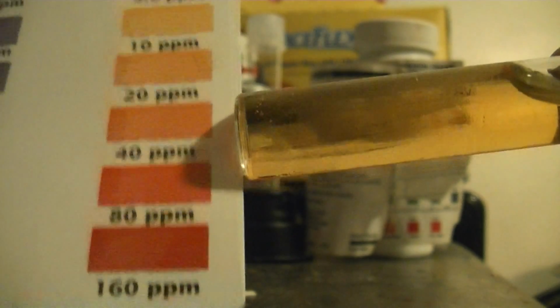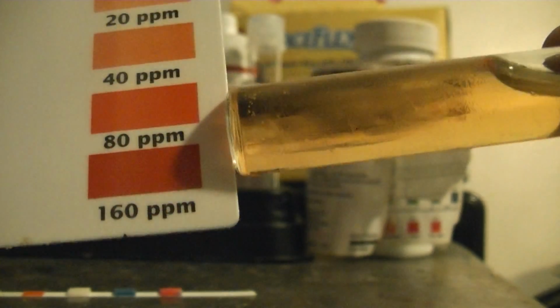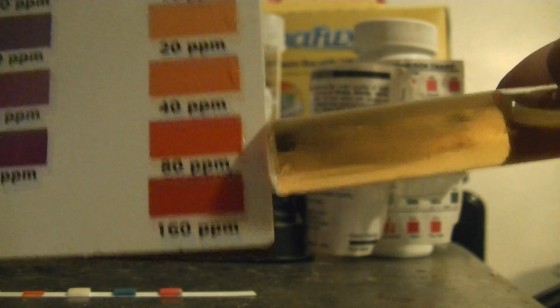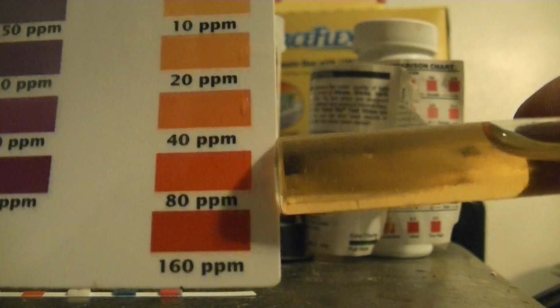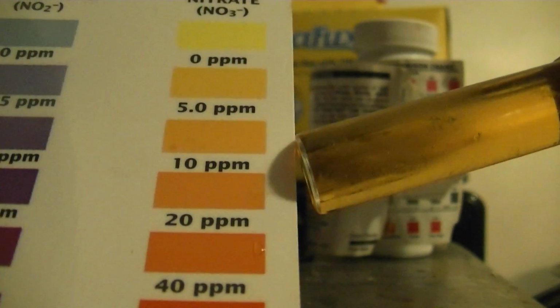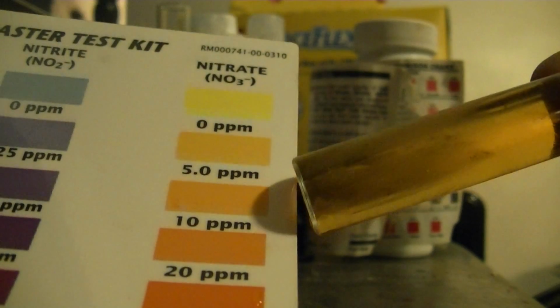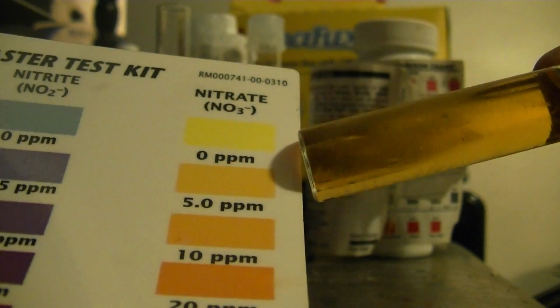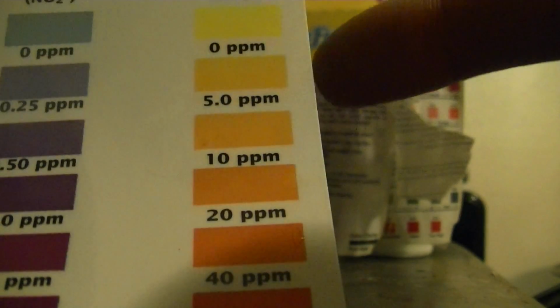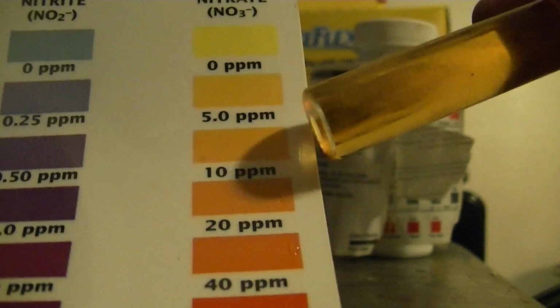You have to worry, if it ever gets red, you're really in big trouble. You're in the 160, 80, and 40 looks kind of red. 80 looks really red, and 160 looks really red. So if you're ever anywhere close to red color, that's really bad. You're going to want to be doing massive water changes to try to fix that. But as long as you're in the really light orange color and you don't have corals, then you're just fine. Of course, yellow would be best, but 5 to 20 parts per million between this color and this color, these three colors, that's a pretty safe range.